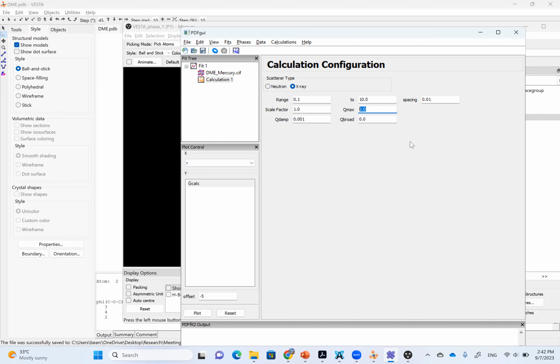So I think we need to explain this more clearly because this is important. I think we need to remind ourselves why we need a high energy X-ray for PDF. Why we cannot do PDF at QS, for example. Why we cannot do PDF using lab X-ray. Because we need long Q range for long range order. Exactly. No, I was looking for the large Q, but it doesn't have anything to do with the order. We need a big Q range, right? So that's basically the Qmax we're looking for.